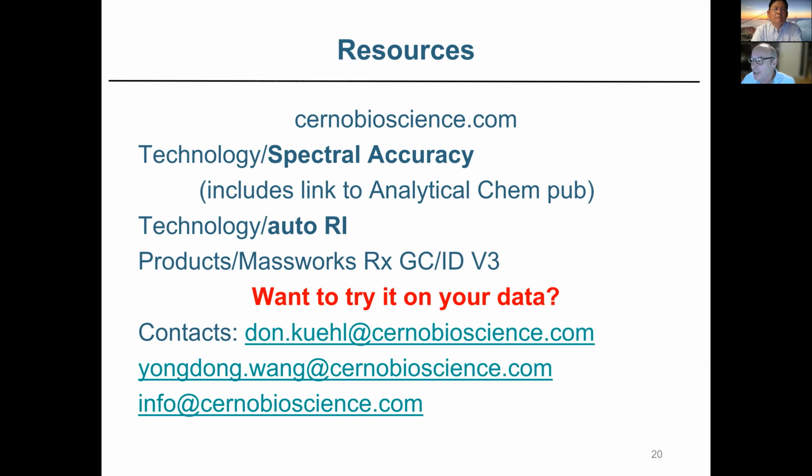I apologize. I forgot to show you that one, but what it means is that you can have data that you've collected for another project that you probably collected in centroid mode, and you're having a problem identifying something, you can run it through this software, and it's going to help you confirm the proper identification based upon those additional metrics.